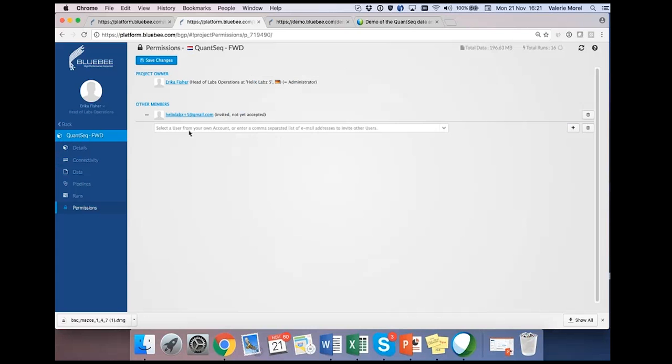So you can just add an email address, and you can invite me. I will receive an email and I will be able to join your project.